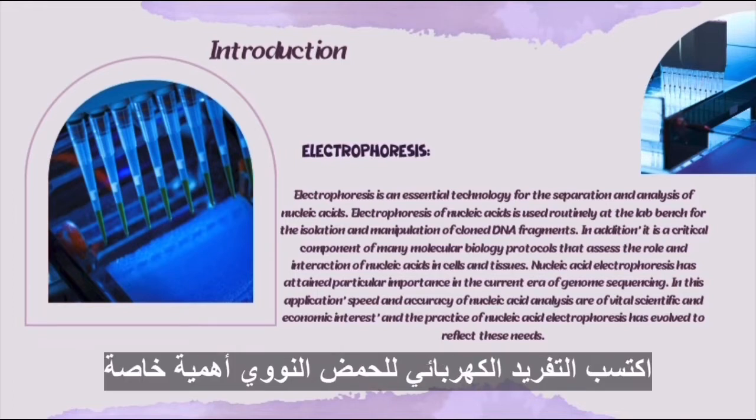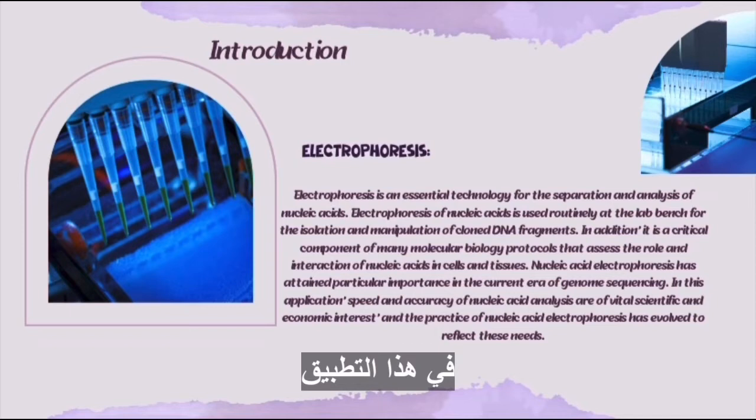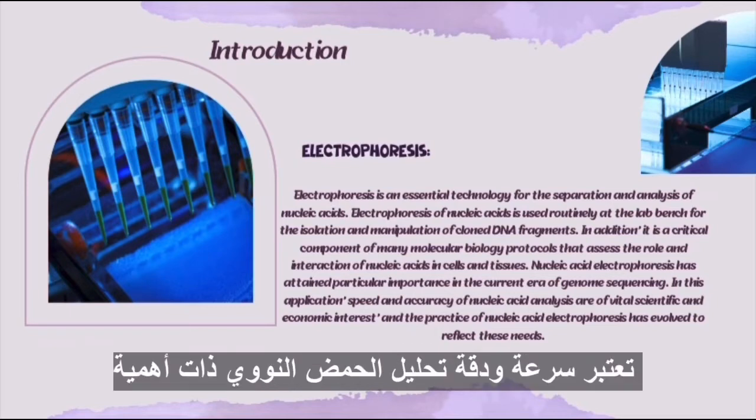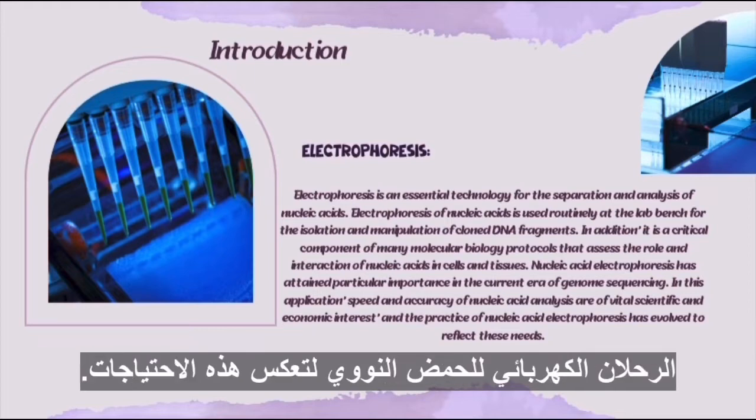Nucleic acid electrophoresis has attained particular importance in the current era of genome sequencing. In this application, speed and accuracy of nucleic acid analysis are of vital scientific and economic interest. And the practice of nucleic acid electrophoresis has evolved to reflect these needs.